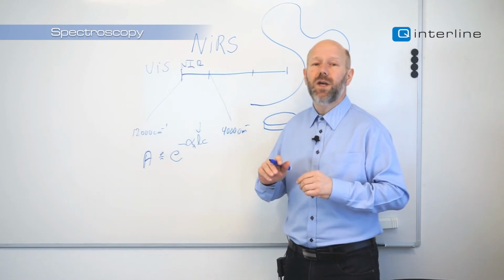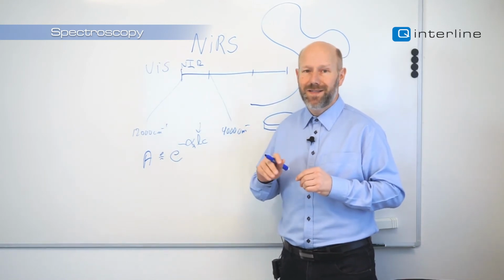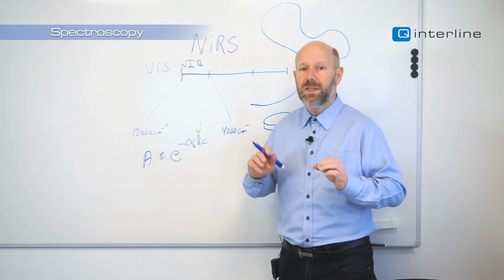In QC, we just want to know, does this sample contain 10, 10.5, 11% of that. Two different questions, two different techniques.